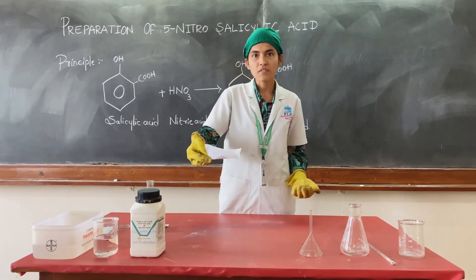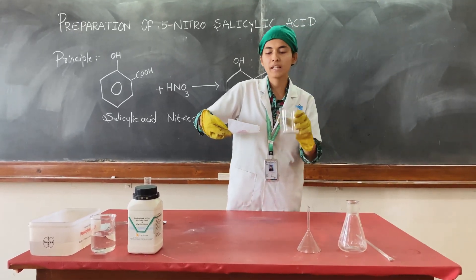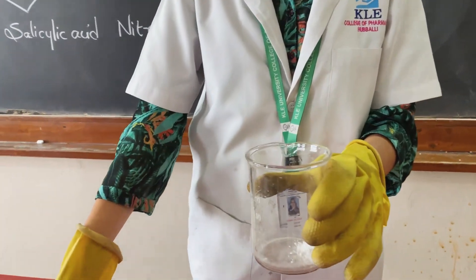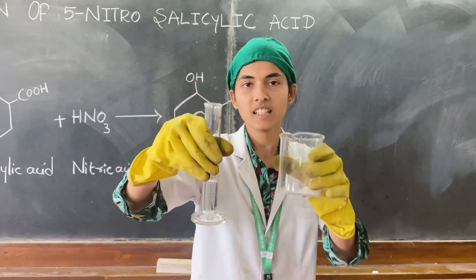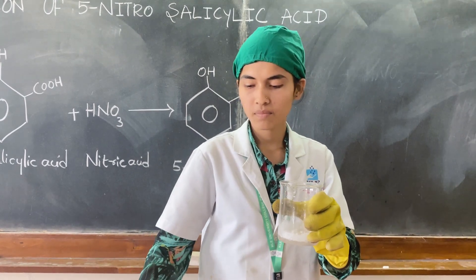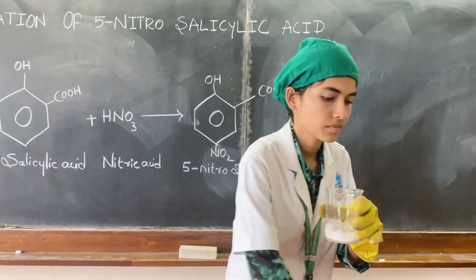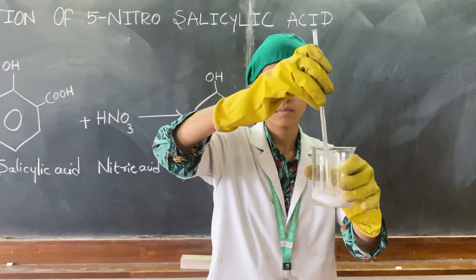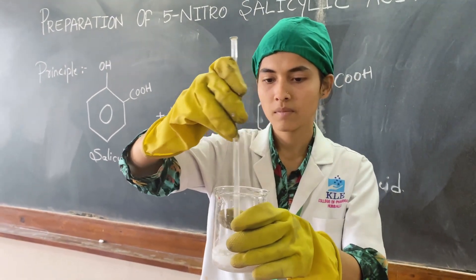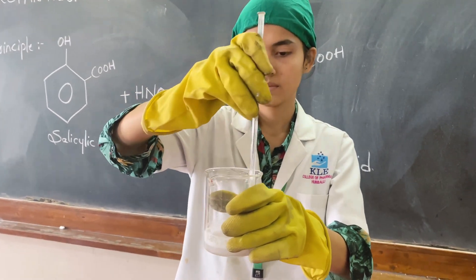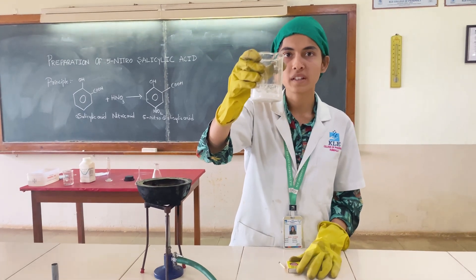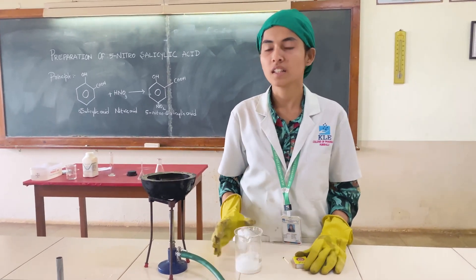We need to take 1 gram of salicylic acid in a 250 ml beaker, add 20 ml of nitric acid into the beaker, and mix it with the help of a glass rod. After mixing it properly, we need to heat it for nearly five to six minutes in the water bath.